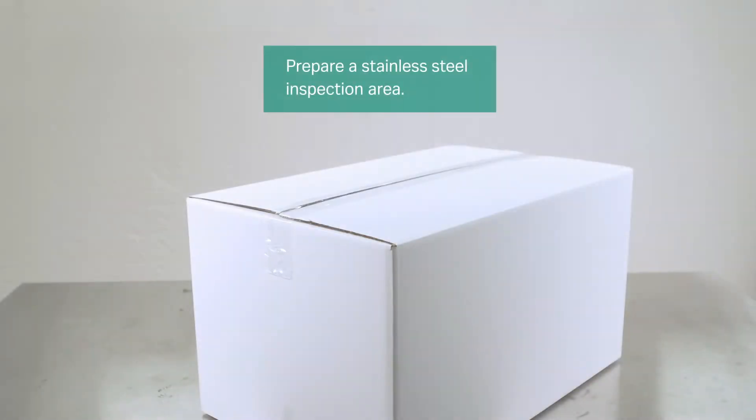Before unpacking the disposable bag assembly, please prepare a stainless steel inspection area and remove all sharp and pointy objects.